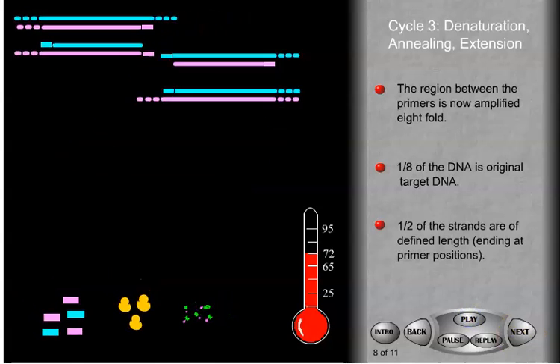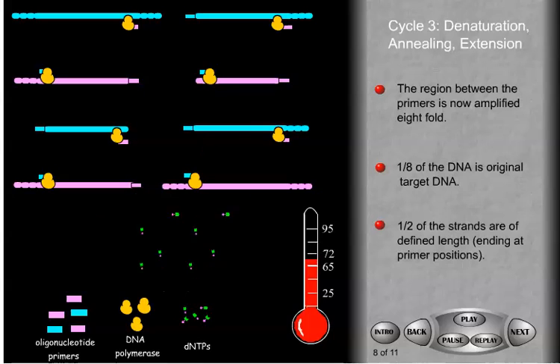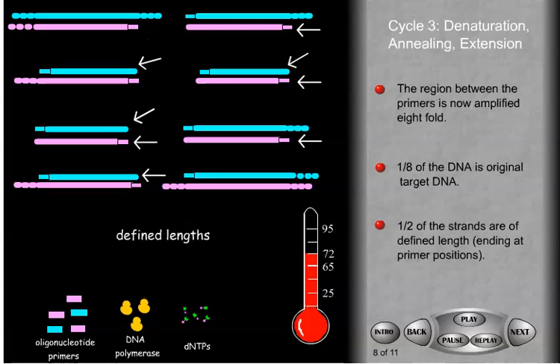As the reaction finishes the third cycle, there are now 8 times as many DNA strands as when the reaction started. Rapidly, the original template is becoming a smaller and smaller percentage of the total template available, and more strands have defined length.